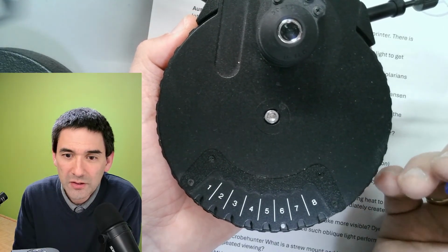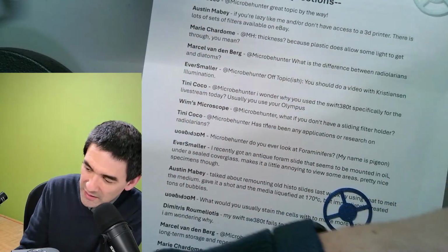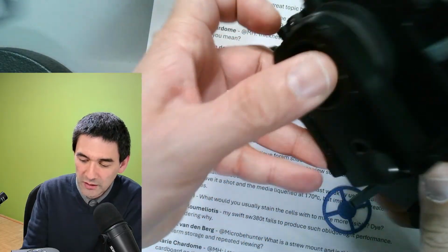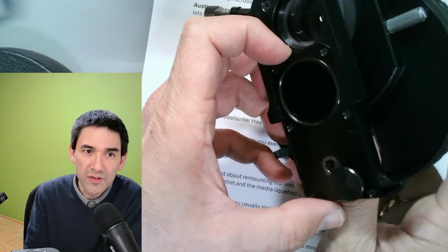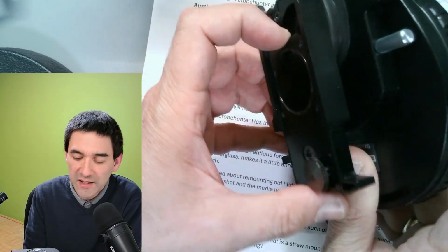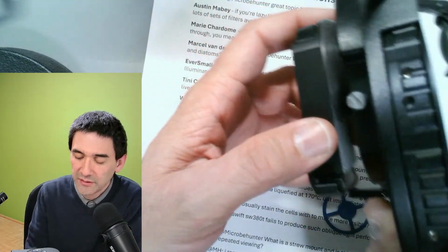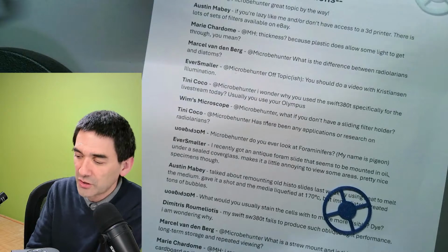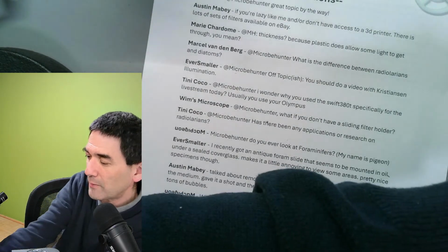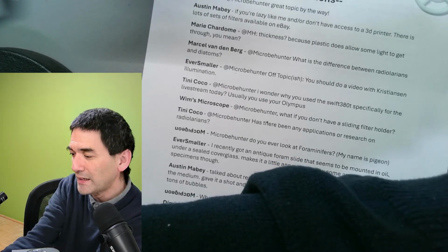So that's it. So you see, it has only purely practical considerations. And by the way, in case you're wondering, this here is a Wollaston. It's also an optical system that it can swing out. It's all for DIC. So I'm just going to put this back simply so that you understand why I've changed microscopes today. In other words, probably not a bad idea anyway.